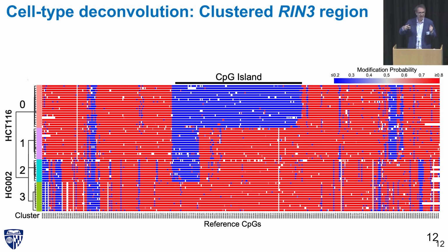And so I can actually see the alleles and what cell type they are falling out of the data naturally just by looking at the methylation. I'm not using SNPs, I'm not using genomics here. I'm only using methylation to be able to distinguish the haplotypes and the cell types from each other. So cell type deconvolution, that's an interesting idea, and that's something that might be powerful, we thought.